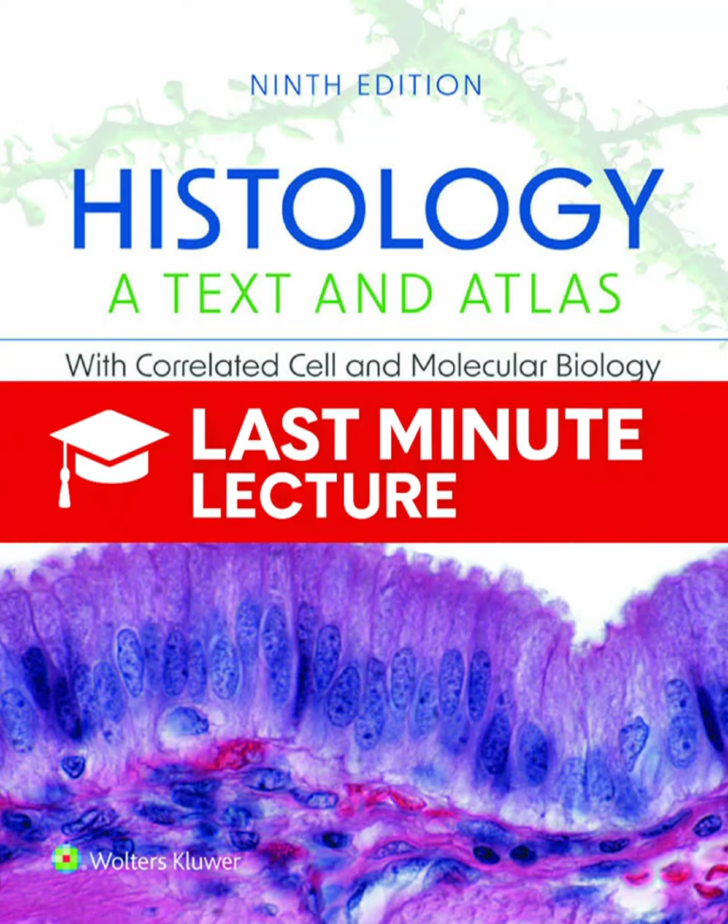So it could potentially replace the need for an expensive EM in some clinical settings? That's the potential. It could fundamentally change how we do diagnostics. We've explored some of the most cutting-edge methods, but the foundation of all of this is still the light microscope. So we should probably step back and make sure we really understand the fundamental optical concepts that govern all of these techniques. Absolutely. When we talk about microscopes, the most critical concept isn't magnification.